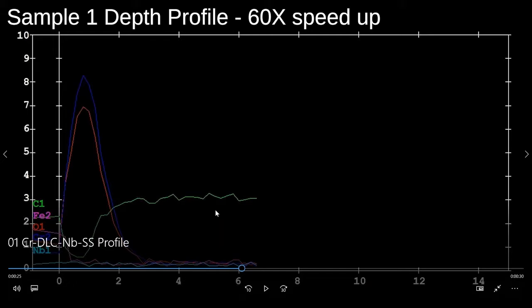And then there would just be a complete empty part of the trace here in the raw data. But if you were looking at processed data, all these traces that are down around the noise would, of course, be normalized up to 100%. As you normalize to 100% for processed data, you might not notice that you missed an element. So looking at the raw data during the profile is important.